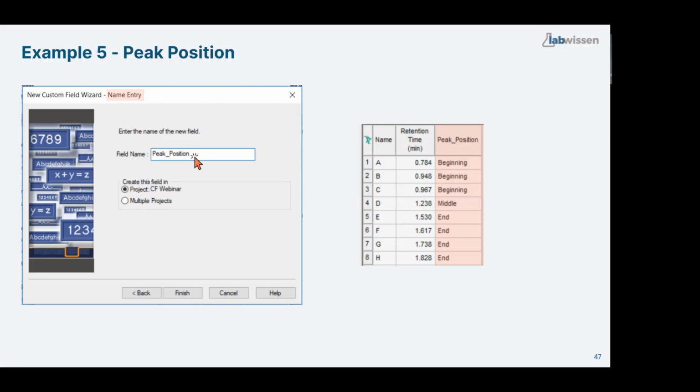So one tip or note: usually in the lab we really have 1 or 2, 3 people who are good in custom fields, and it doesn't really make sense to make all analysts good at custom fields. Why? Because it's something like a skill. If you don't use it, you lose it. The same with custom fields. If you don't really practice it, you forget, and your brain is not working the right way when you need to do complicated calculations. So it's better that one person always does it, and this person has their own algorithms, ways of creating a custom field. It's not necessary that all analysts can do this, right? So that's my opinion on this point. Maybe you think otherwise. It's great when all know about custom fields. Why not?